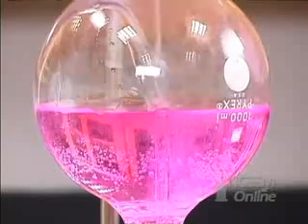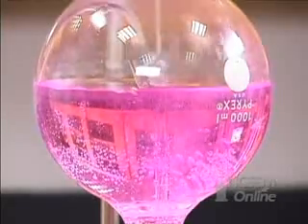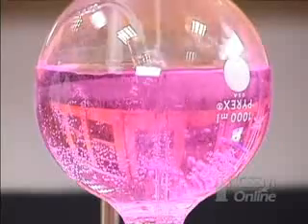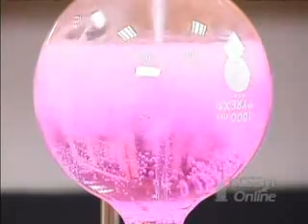Atmospheric pressure will force the water up into the flask — we get a fountain. The solution is pink because ammonia dissolved in water is basic and turns the acid-base indicator pink.